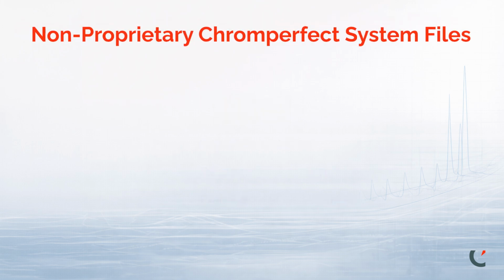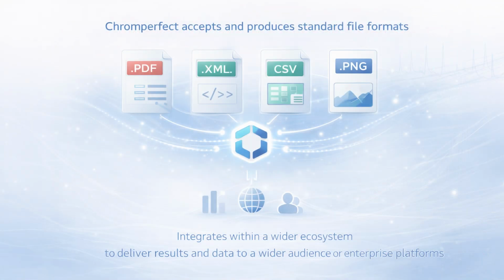Now, let us briefly discuss the non-proprietary or standard files you may encounter when using Chromperfect. Chromperfect also produces output files and can be configured to accept specific data as input files. These file types include, but are not limited to, PDF, XML, and CSV formats. Chromatograms may also be saved as image files, such as PNG. These are widely used file types that you are likely already familiar with. They allow Chromperfect to integrate within a wider ecosystem and deliver results and data to a broader audience or to enterprise platforms.